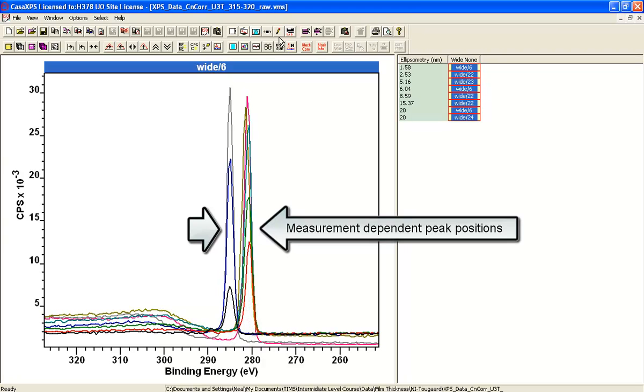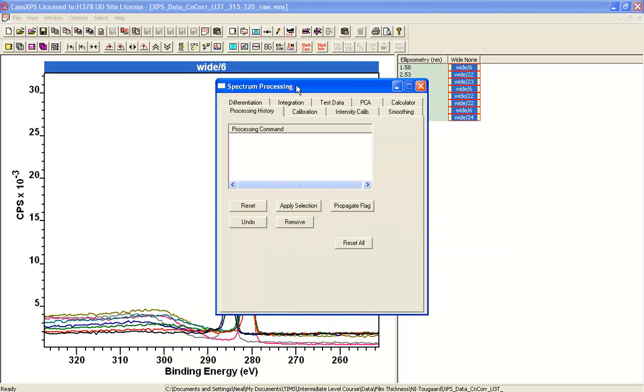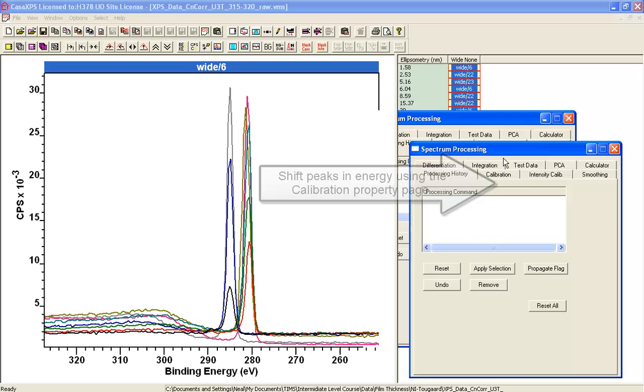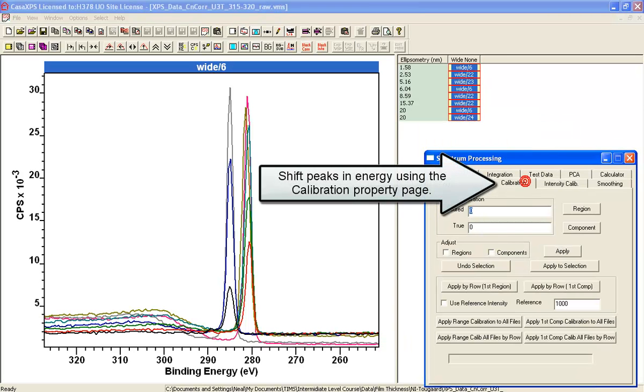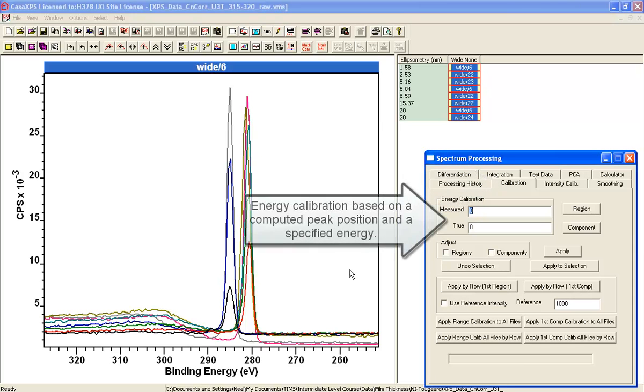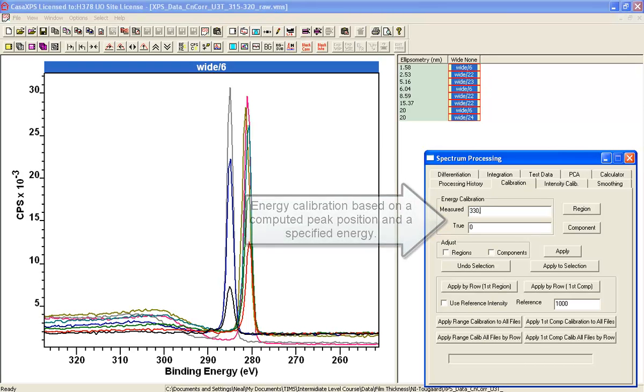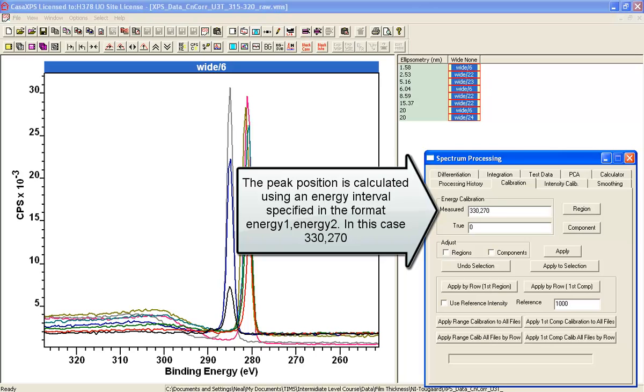So what we'll do is first of all run through and calibrate each one of these spectra based on the survey carbon 1s peak. We'll do this using an option that lets us go over an interval. So I specify an interval which is 330 to 270.